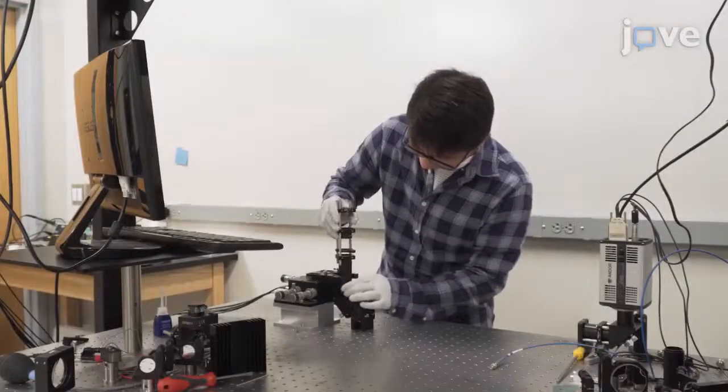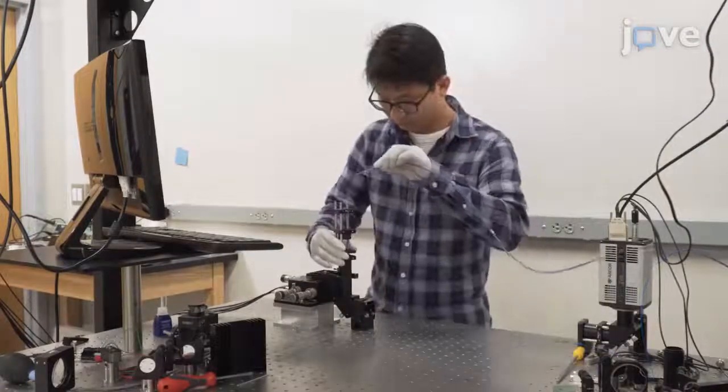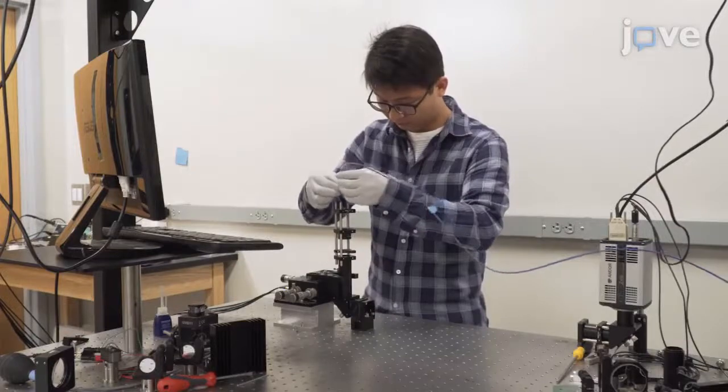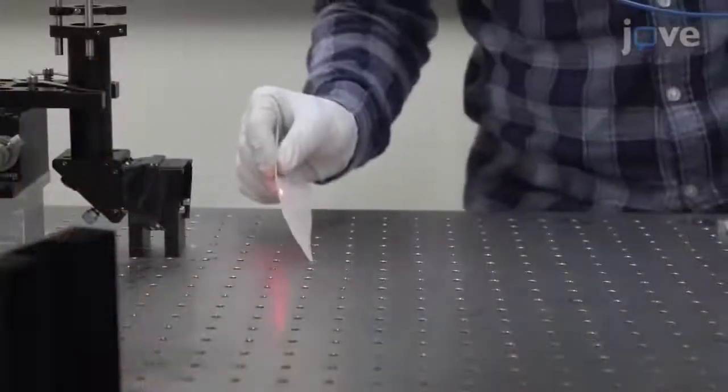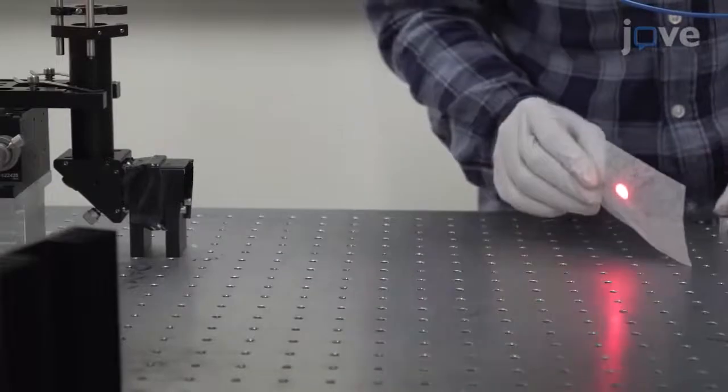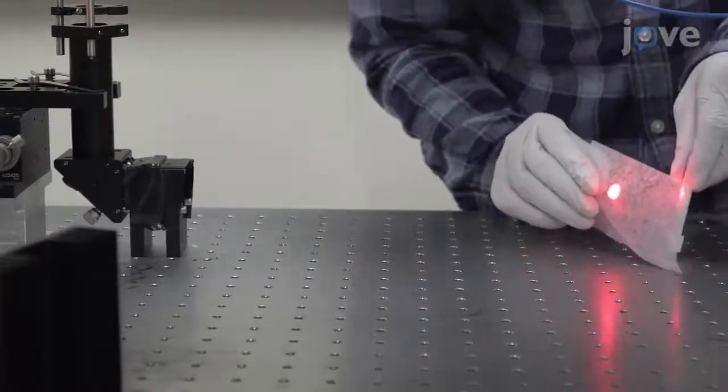Begin work with the detection path. First, place the collimated light source in the microscope body's objective port. Adjust the mirror beneath the objective so the output beam is roughly horizontal and aligned with the bench's holes.